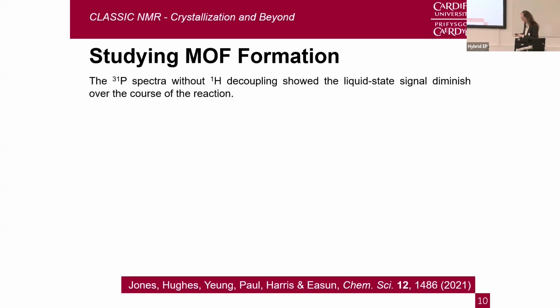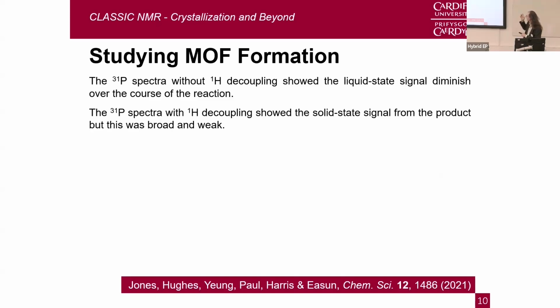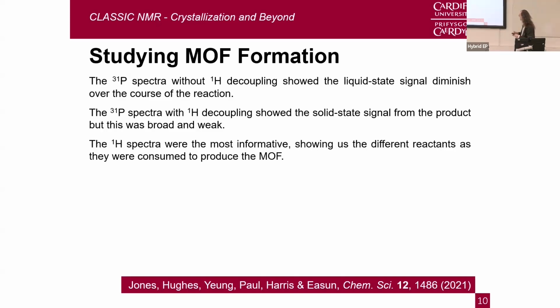We don't get any great insight there. And unfortunately, the phosphorus spectra with proton decoupling do just about show the solid state signal, but it's very broad and very weak. And again, that's probably because the particles that we're producing are very small, and so they're tumbling too fast to see a clear phosphorus signal. But the proton spectra, showing us the liquid state, that's a different story.